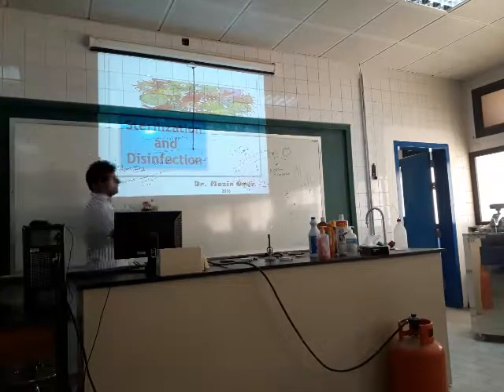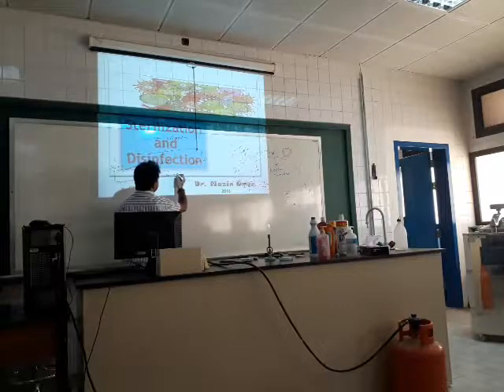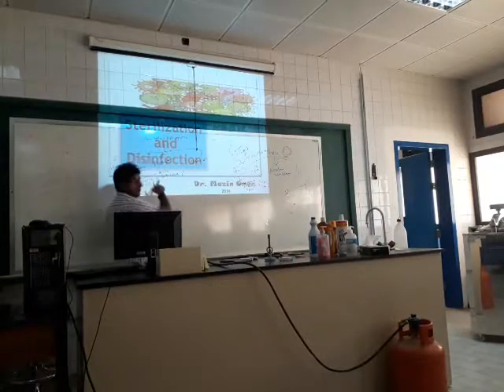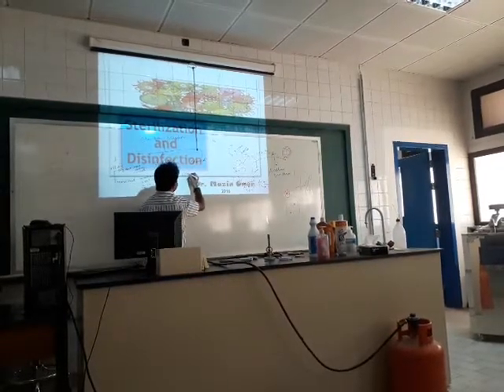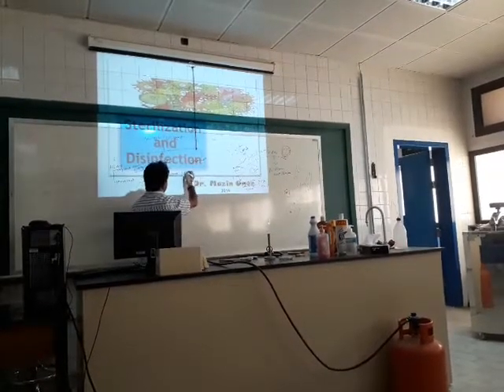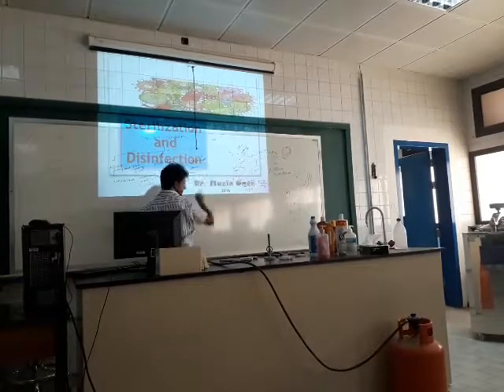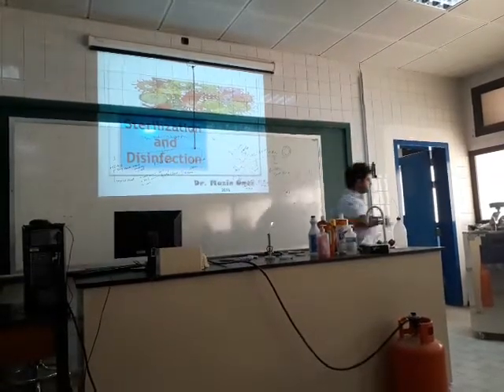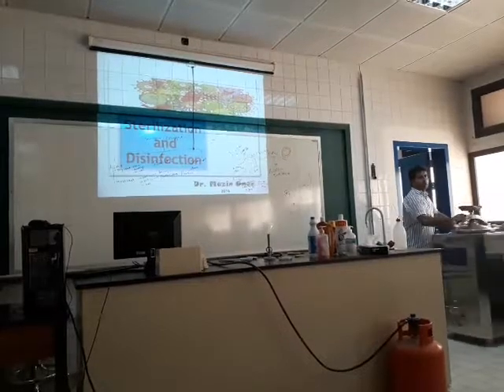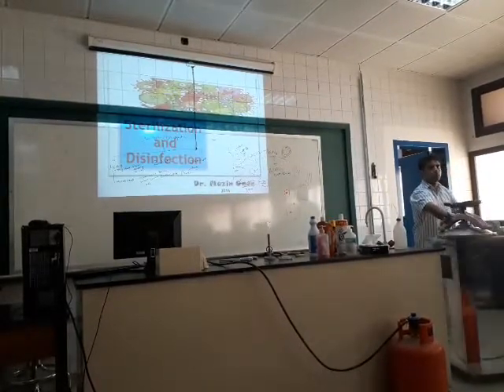Greater than 100 is the autoclave, for example. Boys, this is a machine. This machine is called an autoclave, okay?